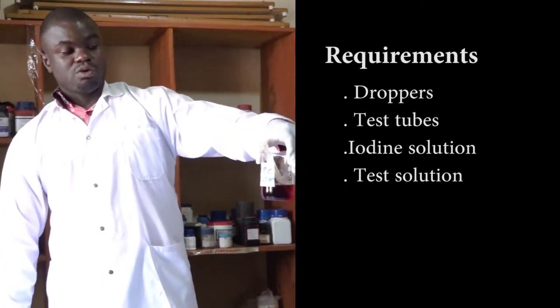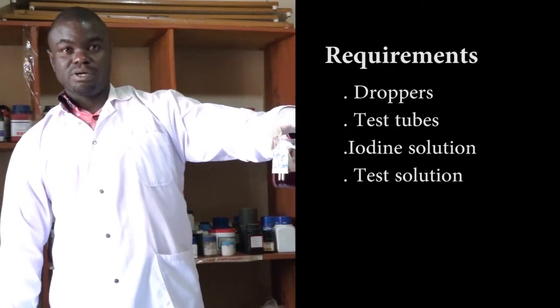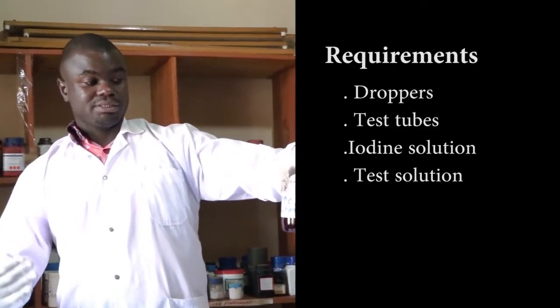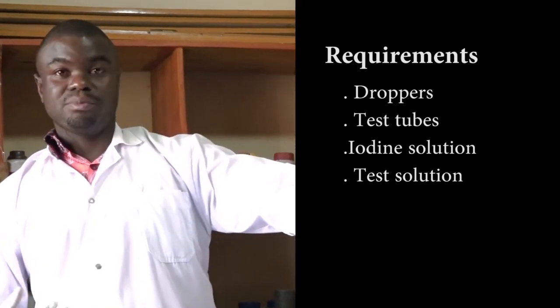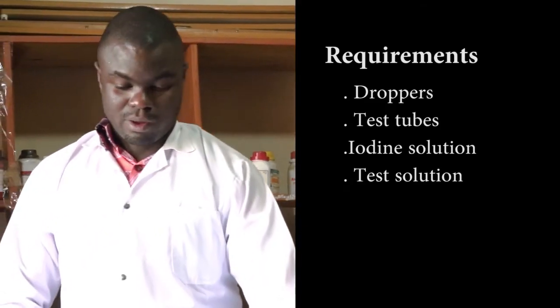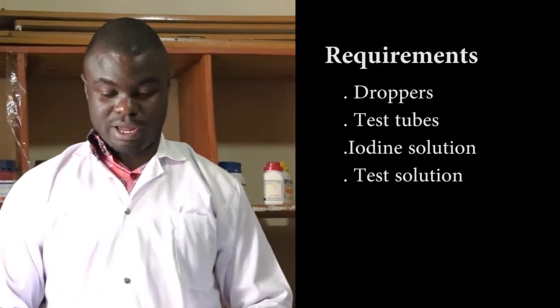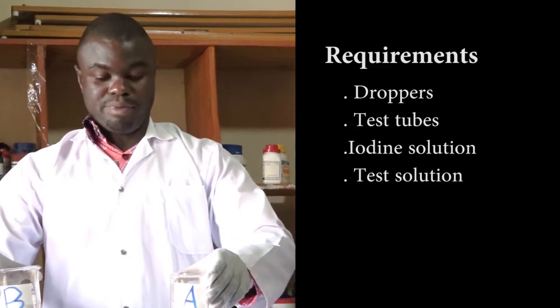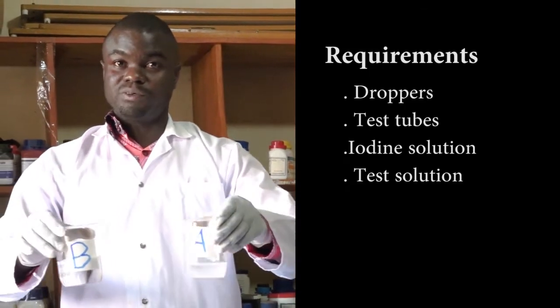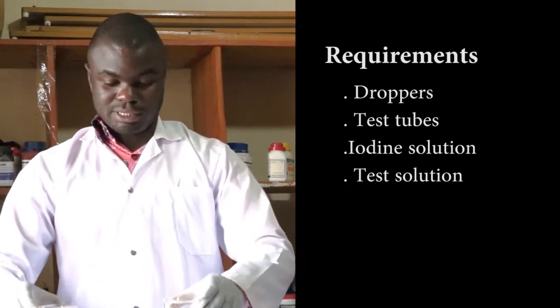It is normally brown in color when concentrated. It is simply a mixture of iodine crystals in potassium iodide. We also need the sample solution and here I have got two solutions A and B, and we have to investigate which one of the two contains starch.